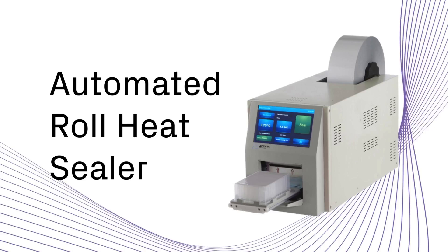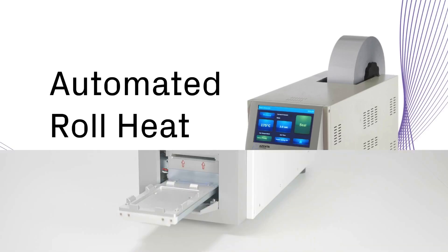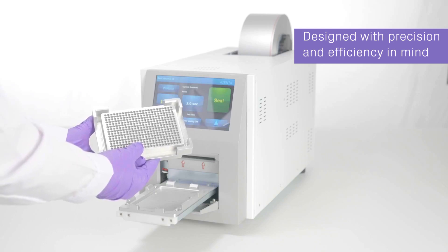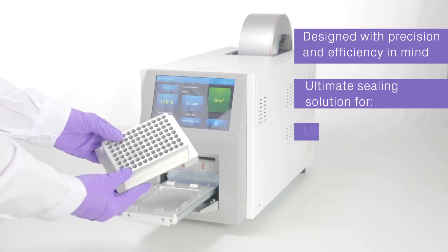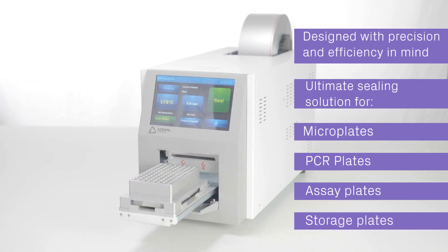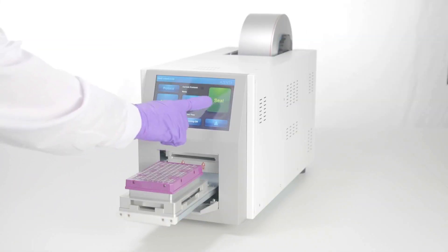Welcome to the future of laboratory automation with the automated roll heat sealer from Azenta Life Sciences. Designed with precision and efficiency in mind, the state-of-the-art heat sealer is your ultimate solution for sealing microplates, PCR plates, assay plates, and storage plates in your lab quickly and securely.